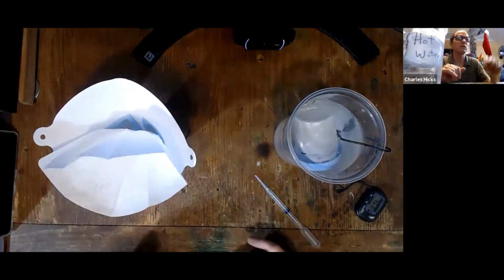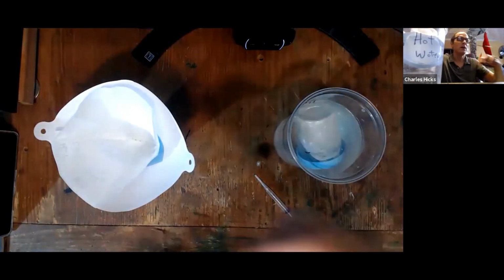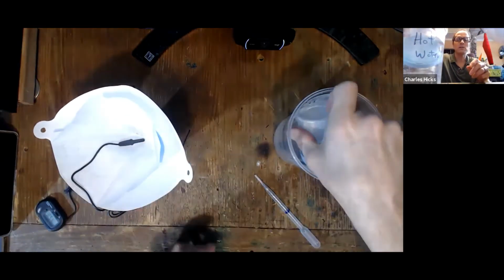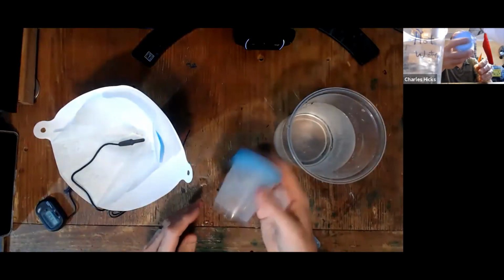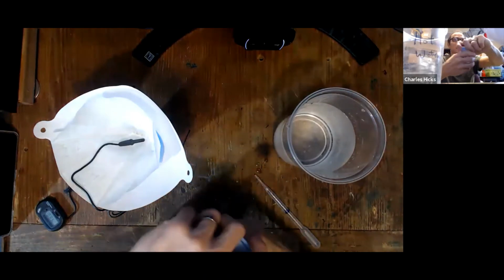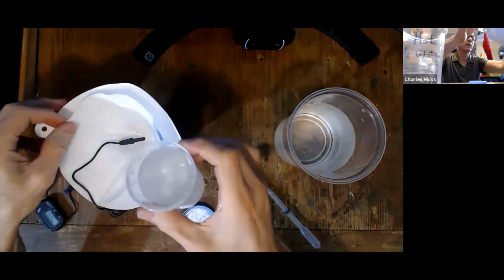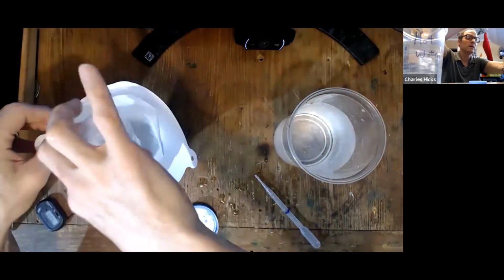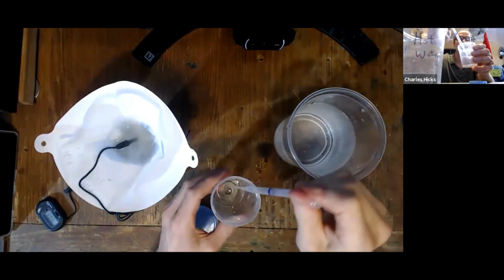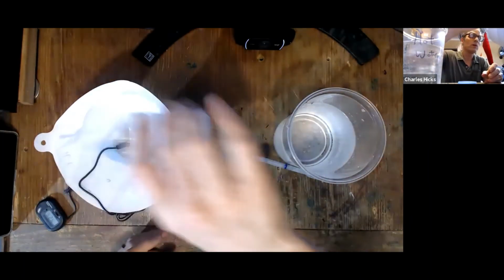Now, after 2 minutes has passed, I'm going to take the thermometer from here and transfer it over here. Okay? And I'm going to take the solution out and give it a shake and tap. Some of the solid isn't dissolved. It's on the bottom. I want to transfer, if I can, all of it. And I'm going to pour it over into the funnel here. Okay. In order to make sure all of it gets transferred, I'm going to take one full dropper full, that's about 3 ml, squirt it in here, swirl it around, and wash it into the funnel.